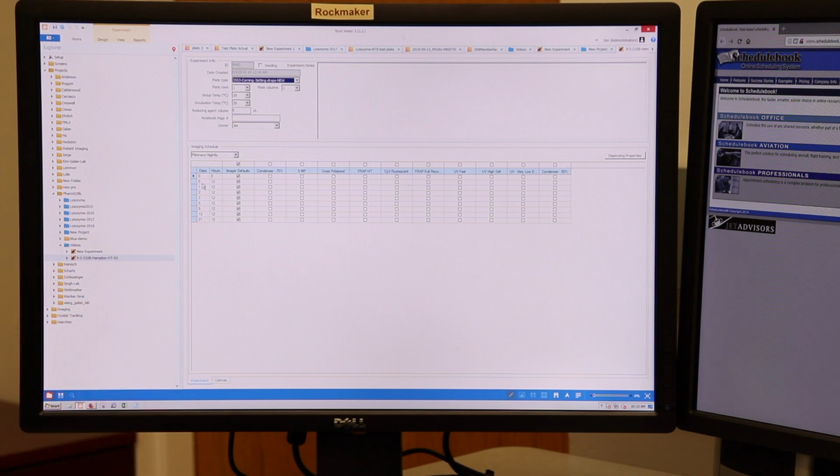And the Fibonacci sequence is just the sequence of days here. You can modify this and customize it and add different amounts. So I just added one at 6 hours. That's useful. If you realize your crystals are growing quite quickly, you can add earlier time frames, and you can also add later ones. If you start noticing something at 21 days, you can add 25, 30, etc.